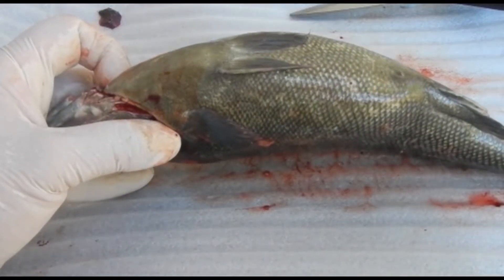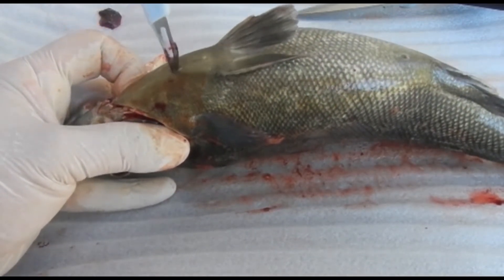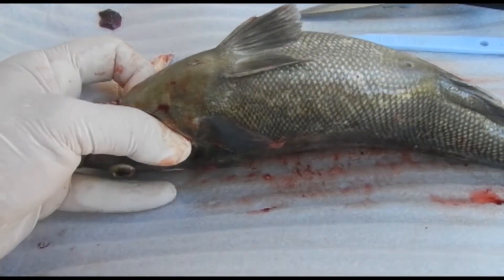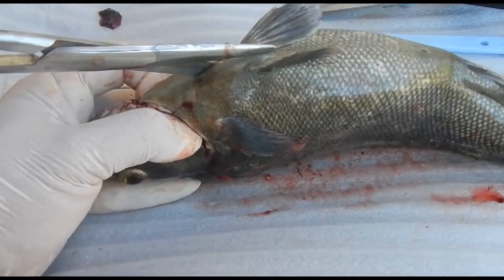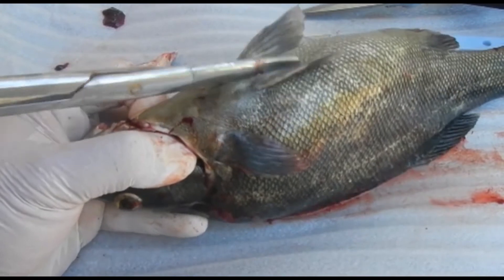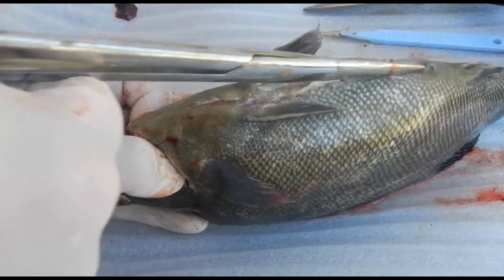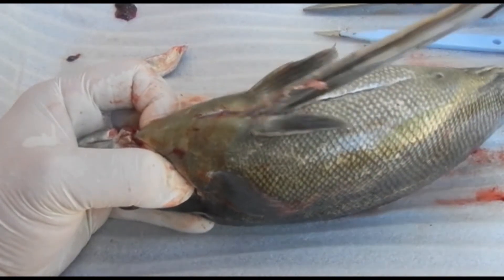Now we move on to dissecting into the fish. I'm producing a small incision to get in, and then extending it with a pair of scissors. When cutting through here, if you stay very midline you can avoid the pelvic girdle, which is difficult to cut through. You have to stop short of the vent so that you don't damage any of the internal organ structures.